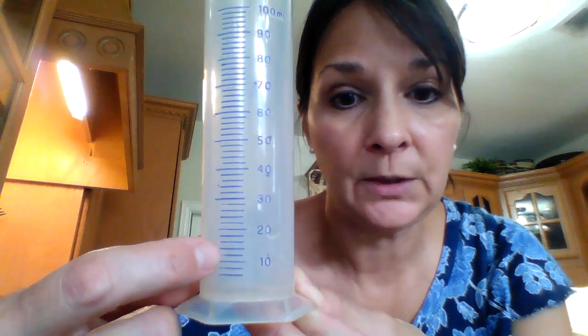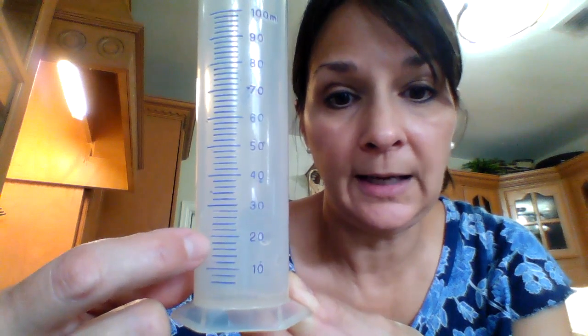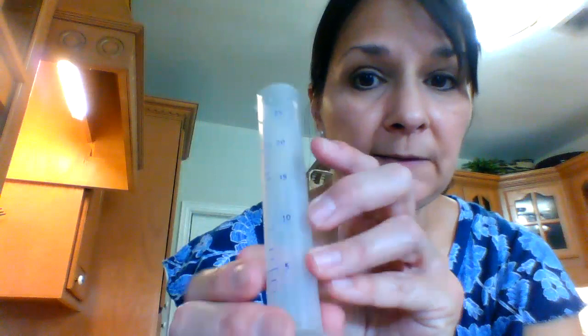Now let's test that. So 10, 12, 14, 16, 18, 20. Okay, so we know that in this graduated cylinder, we're counting by twos. Okay, I have another graduated cylinder here. Let's see if this one counts the same.